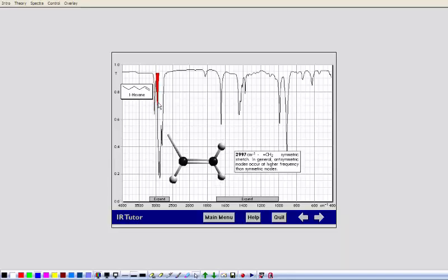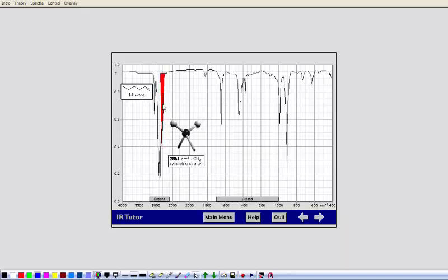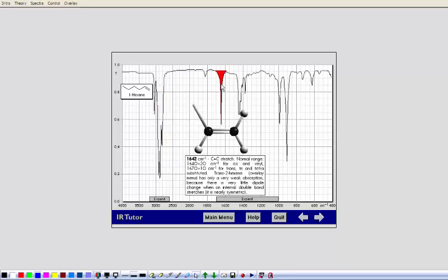And then after that, everything else is just alkanes, because you get below 3,000, and there's the rest of your alkane molecule of the hexene. Somewhere in here, the carbon-carbon double bond stretch is. It's at 1,600, but notice its intensity, the amount of dip isn't very much. So it's not a very intense peak by any stretch of the imagination. And sometimes we see it and sometimes we don't.